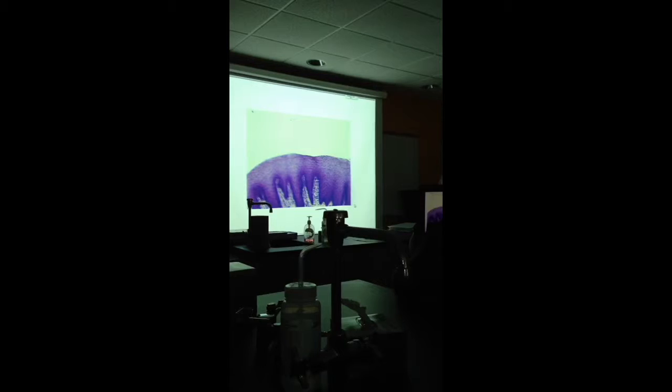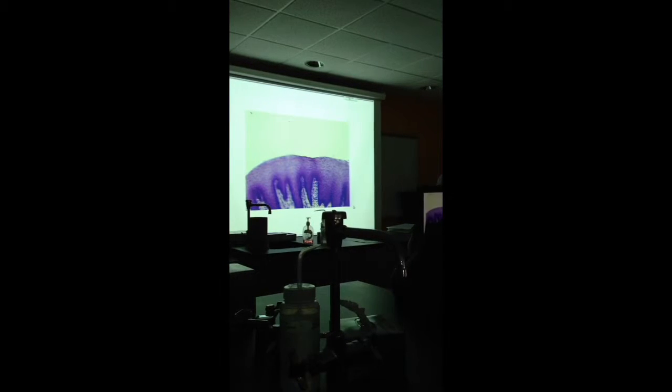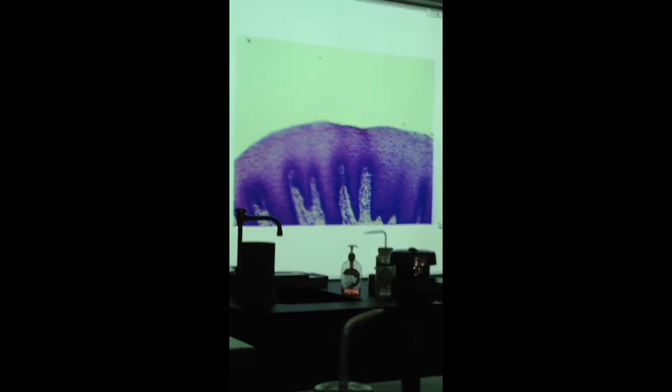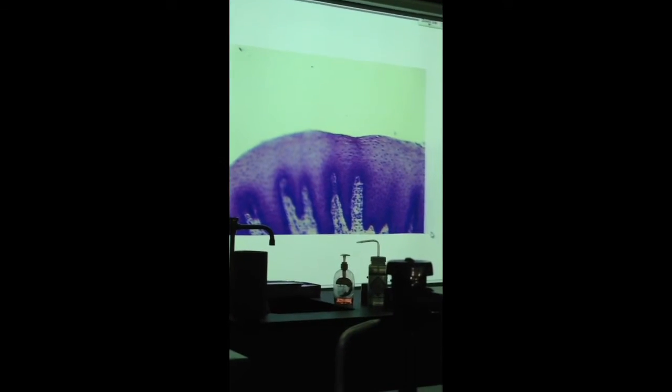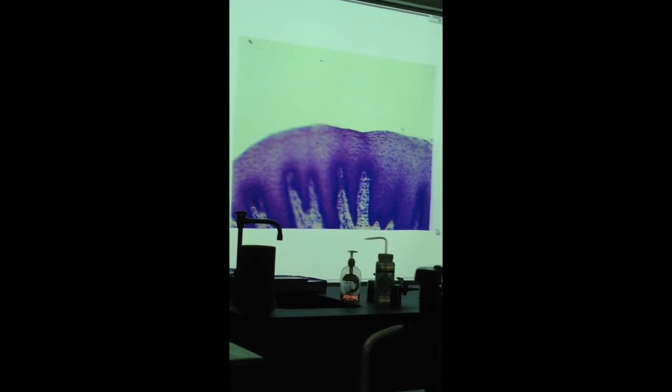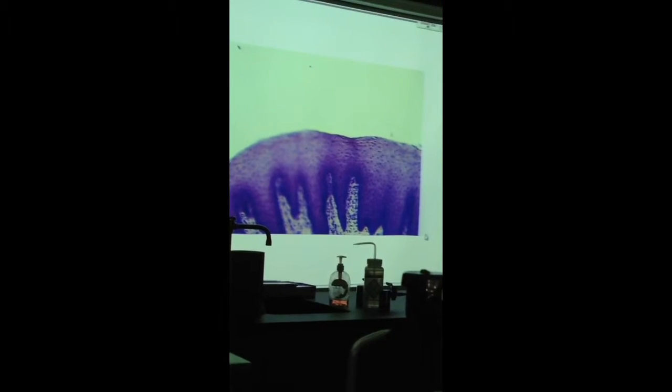At the other end, when you need a thicker layer of tissue to protect, you have this non-keratinized stratified squamous. That's what we see here. Okay? Under the tongue category, if you look on page 10 of your lab objective sheet, toward the top of the page, it mentions the papillae. There are three major types of papillae in the human tongue. These are projections on the surface of the tongue. First one listed there is the circumvallate papillae, and that's what you see here.